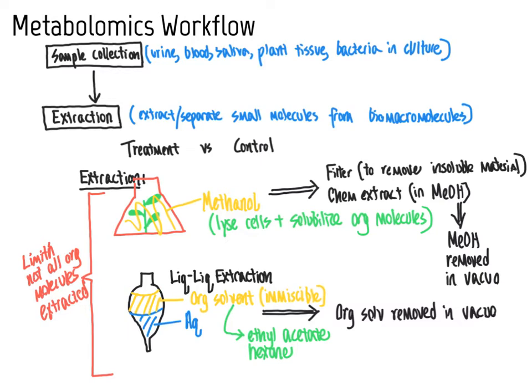And so as a result, when we use the term metabolomics and we define it as looking at all of the metabolites that are present within a cell, that's a bit of a misnomer because some of the compounds are going to be missed as a result of limitations at different stages of the workflow here, with one of those stages where the compounds can be overlooked or missed is at the extraction stage because the compound simply is not well extracted into the organic solvent.